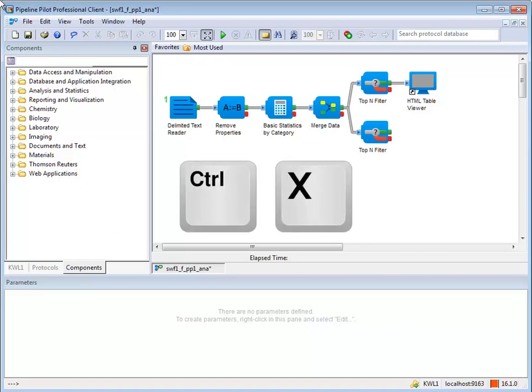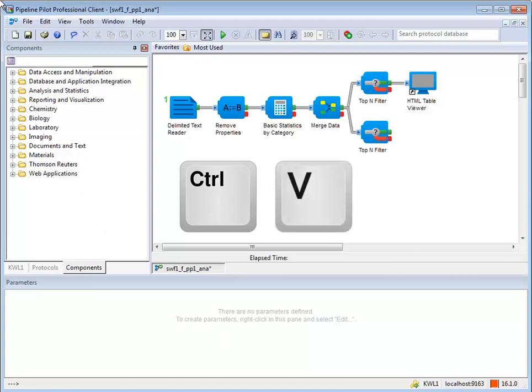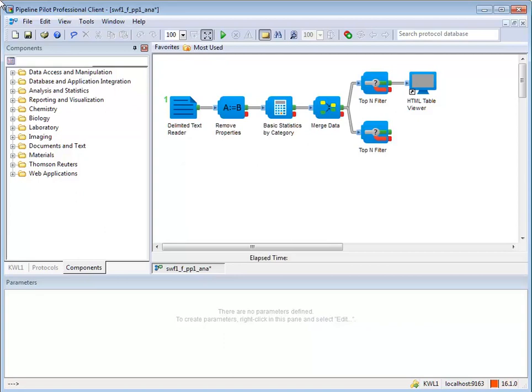Ctrl plus X cuts, Ctrl plus C copies, and Ctrl plus V pastes.